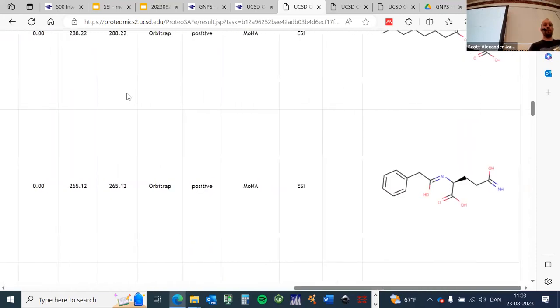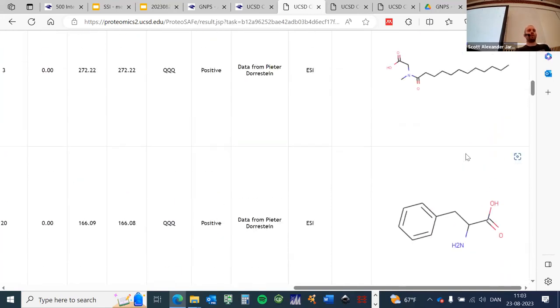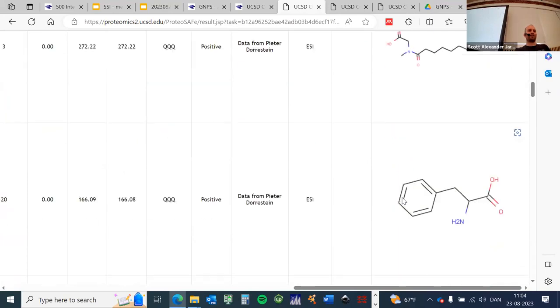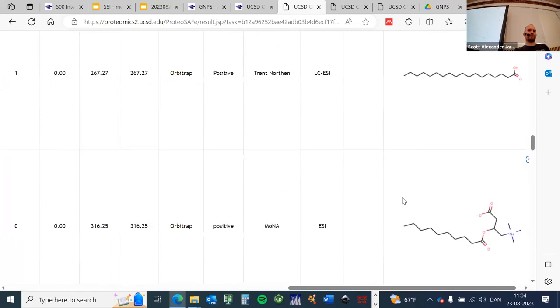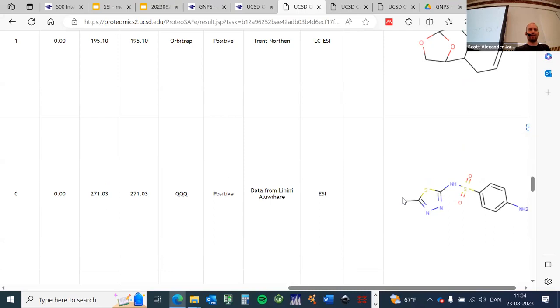If you scroll all the way to the right, for all the library IDs that contain SMILES codes, the molecule will also be drawn. The natural product chemists here can share the fascination of quickly scrolling through structures and seeing, oh, there's a new moiety, or this looks interesting. For me, the colors just indicate the different atoms, so it makes it easier to see, oh, this is a nitrogen, or here's a sulfur.